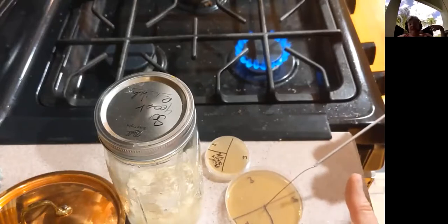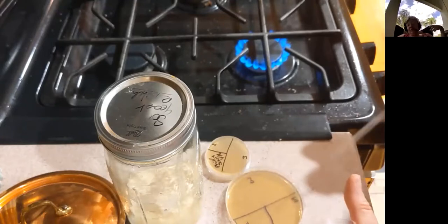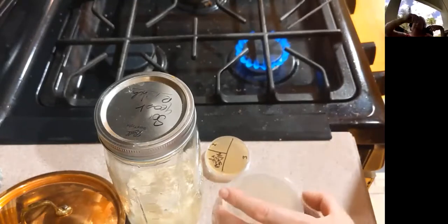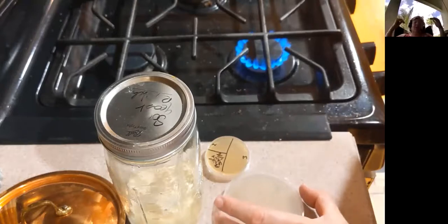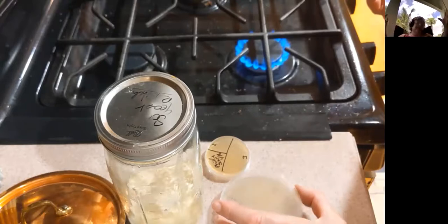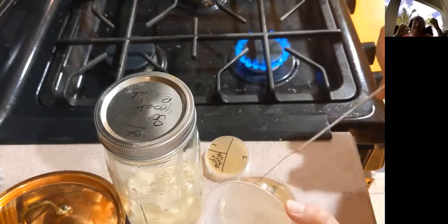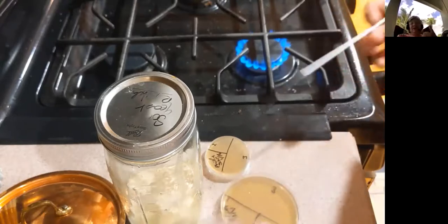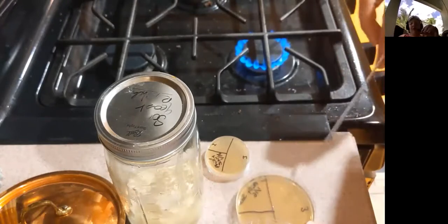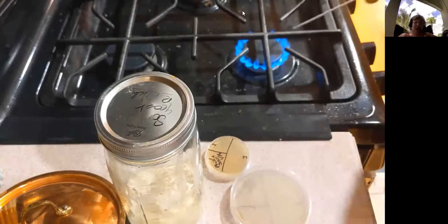And then spreading some more in quadrant 2. I'm going to repeat that a third time. What this allows us to do is dilute out the yeast so that every single yeast cell or bacterial cell in that culture is now going to grow on the plate as a single point of growth.